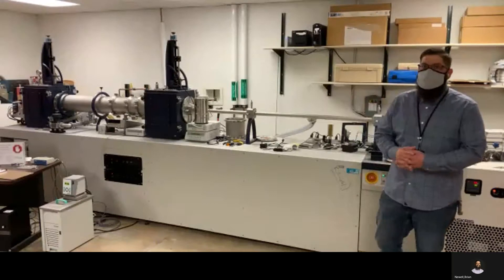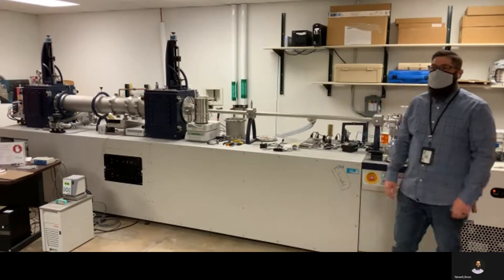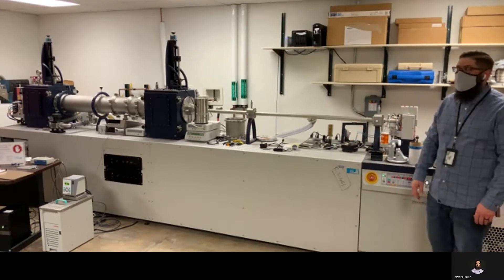Hi everyone, it's Brian here again with the Materials and Molecular Analysis Center here at Colorado State University. The instrument I'd like to talk to you about here is our small angle x-ray scattering system.